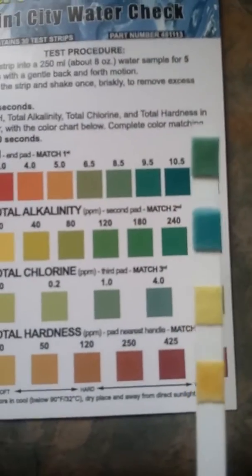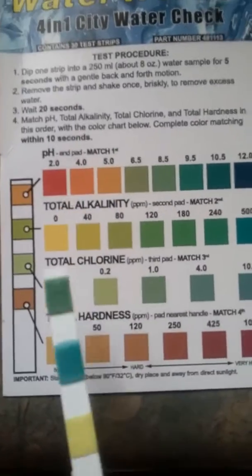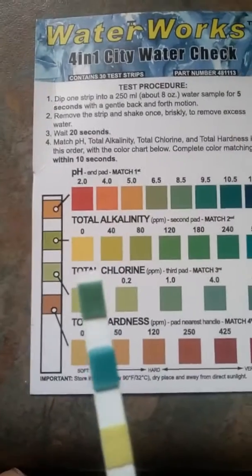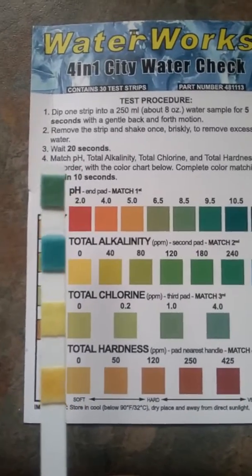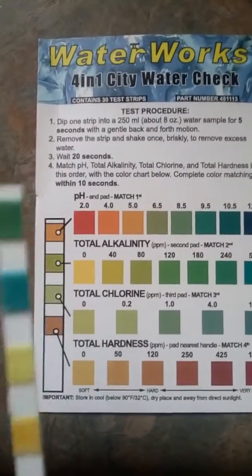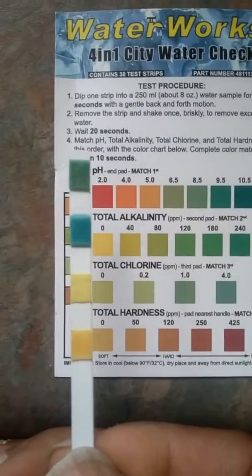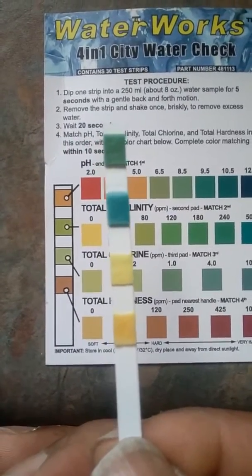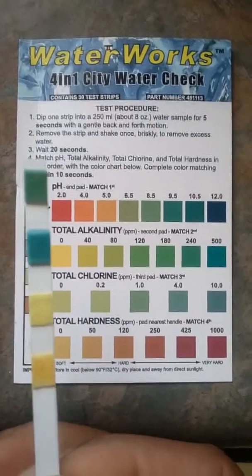The next one down is chlorine. On this side it's zero — we're even below the zero indicator. The very bottom one is hardness, and we're below zero on that as well.